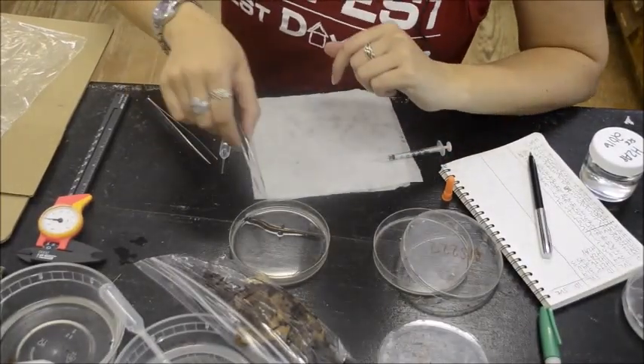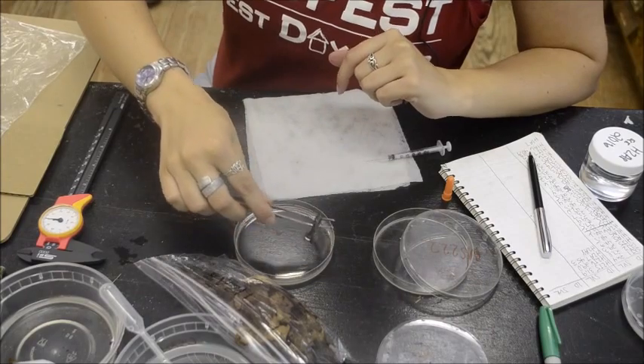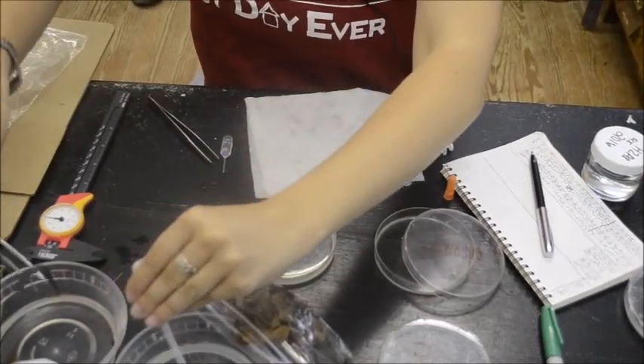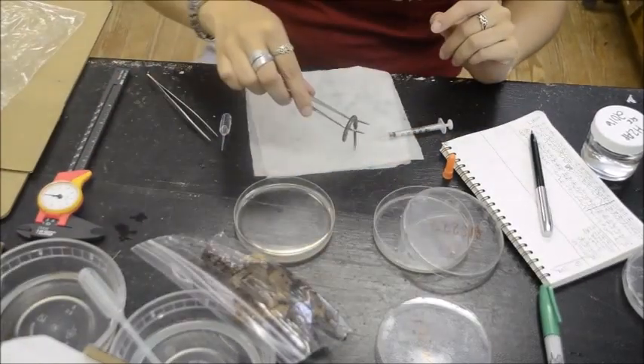First, we start them off in a solution of MS-222. It is 2.25 grams per 1 liter of water. You buffer that down to a pH of 6.5.